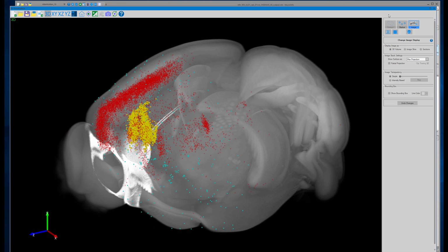So the way we always do this is we cut frozen brains, and it takes about half an hour to cut a brain. Then the immunohistochemistry that we run on these is overnight, but it's not manual time, it's just waiting time. Then it takes about 45 minutes to an hour to mount the brain. So the manual part of processing a single mouse brain is an hour of cutting and an hour of mounting at the end.